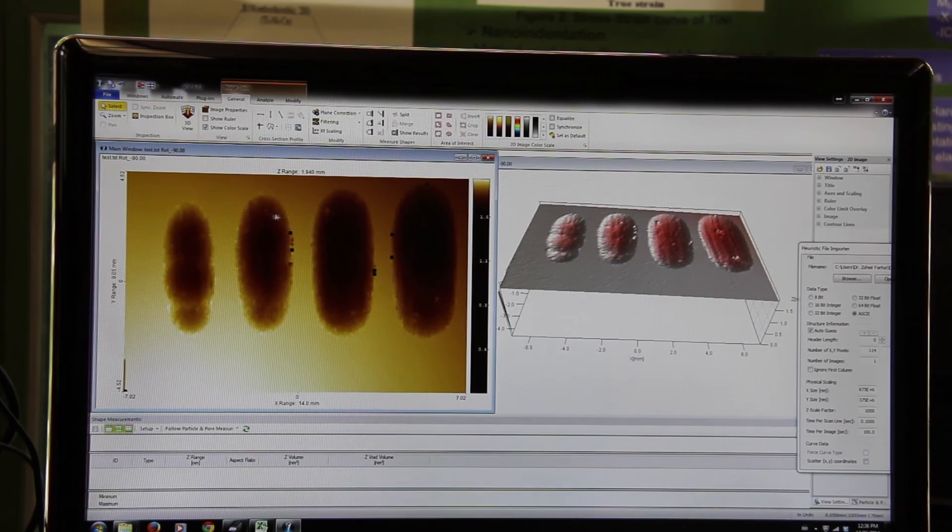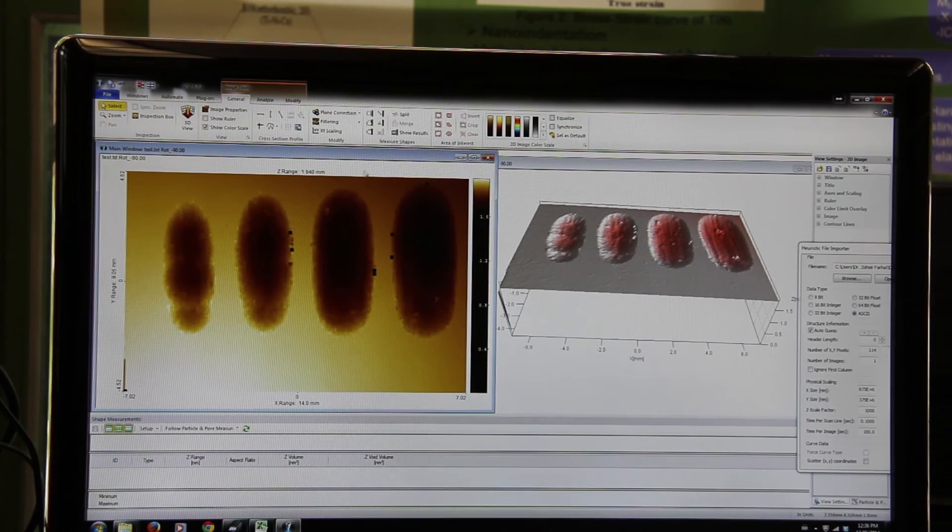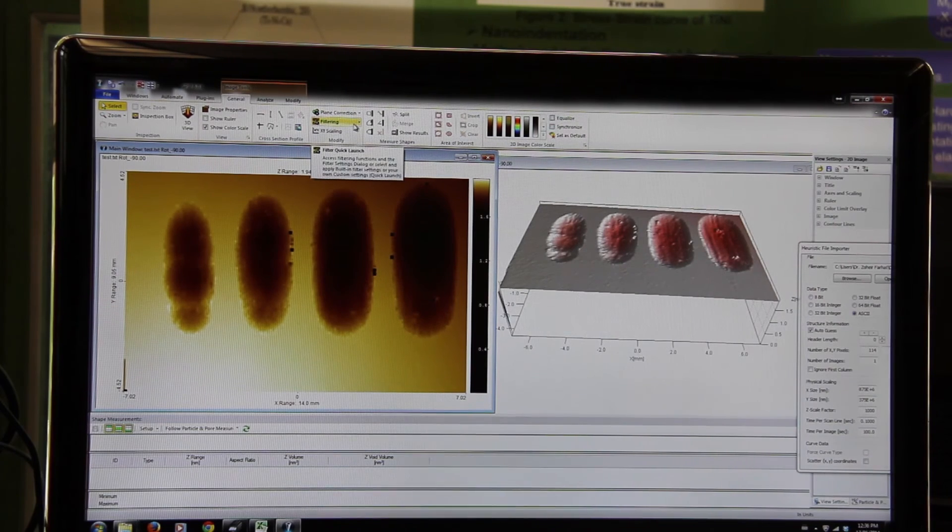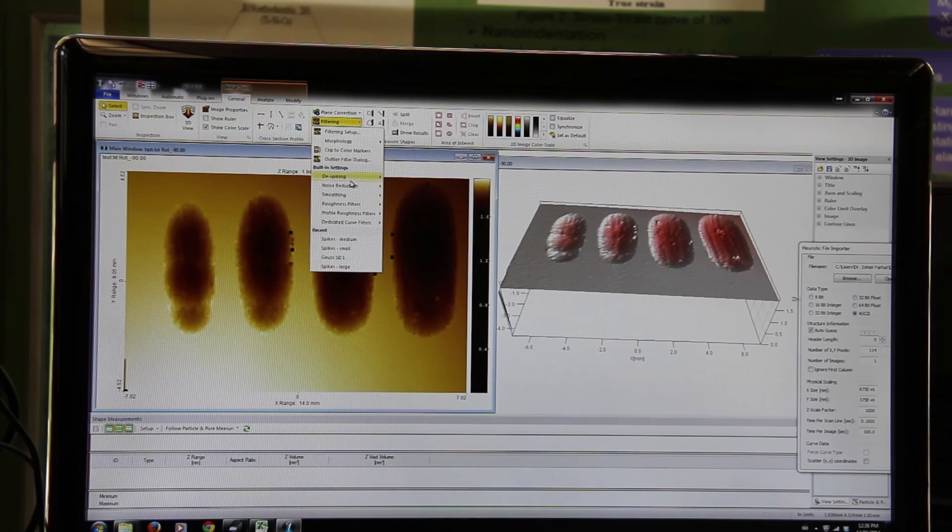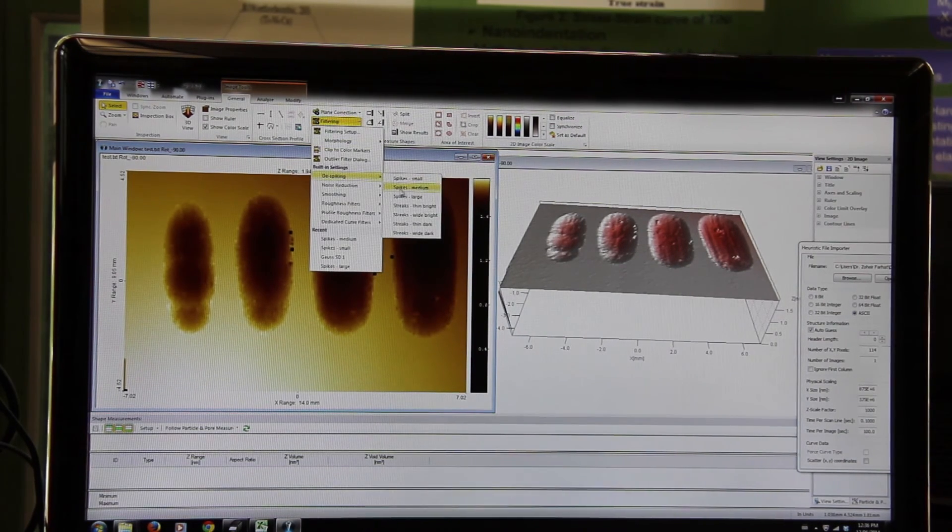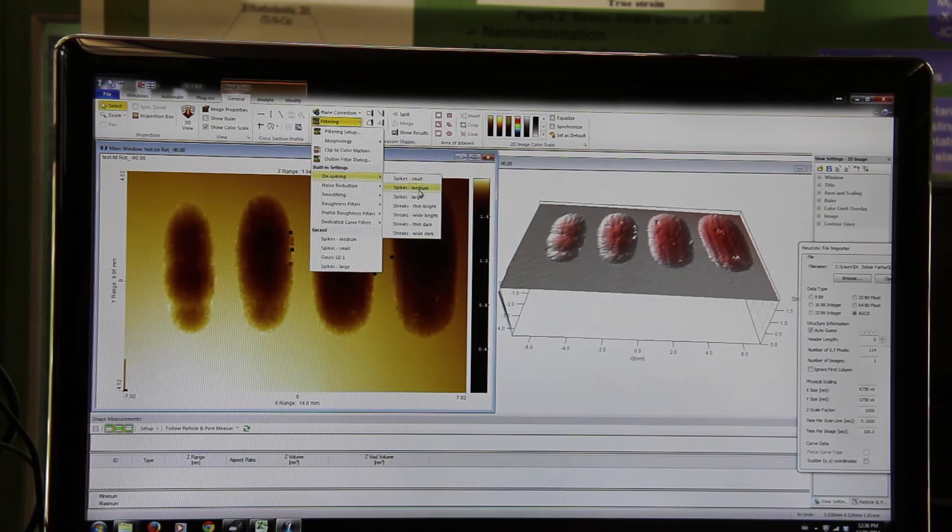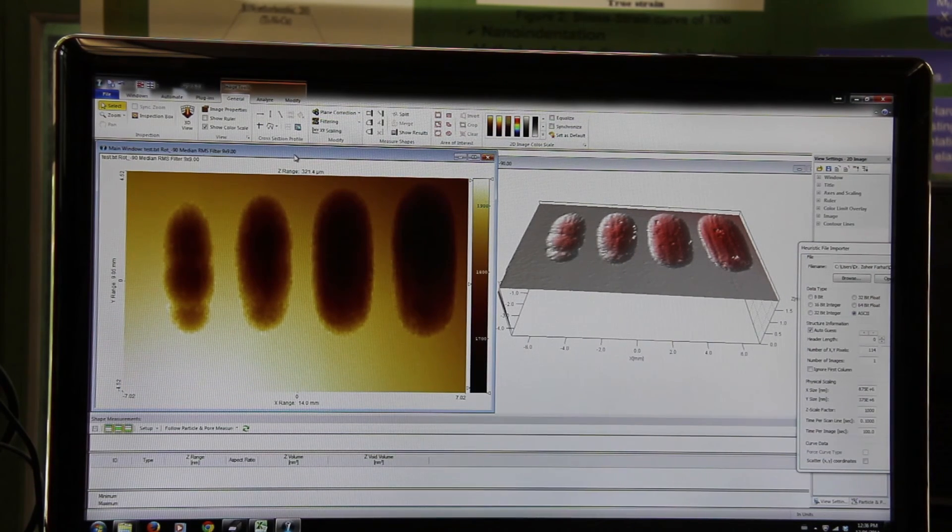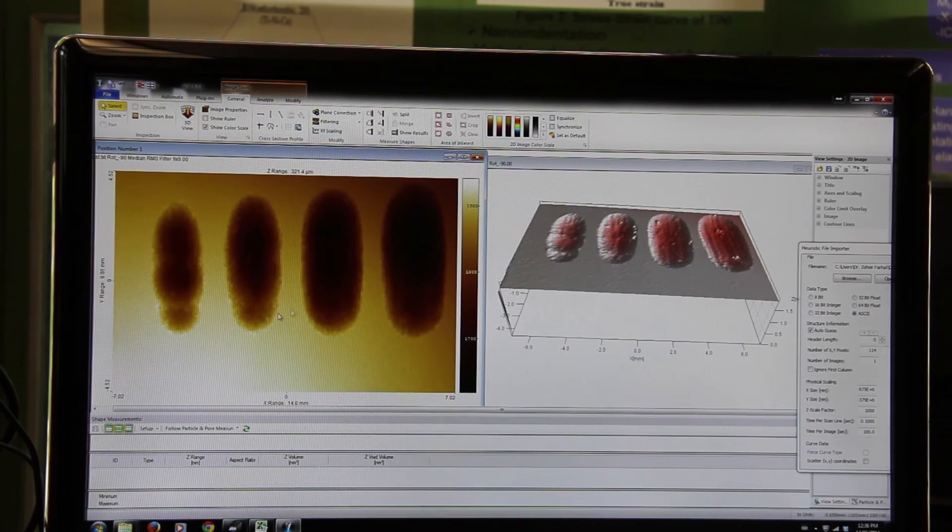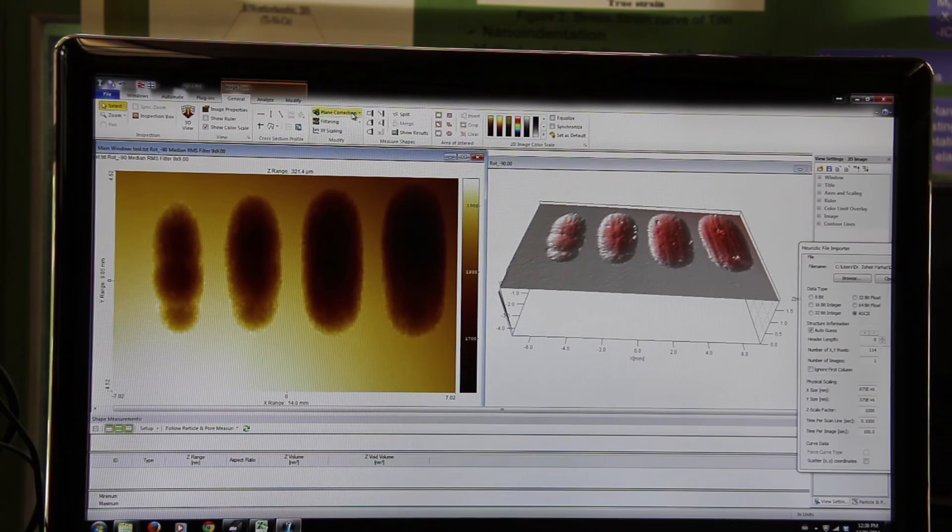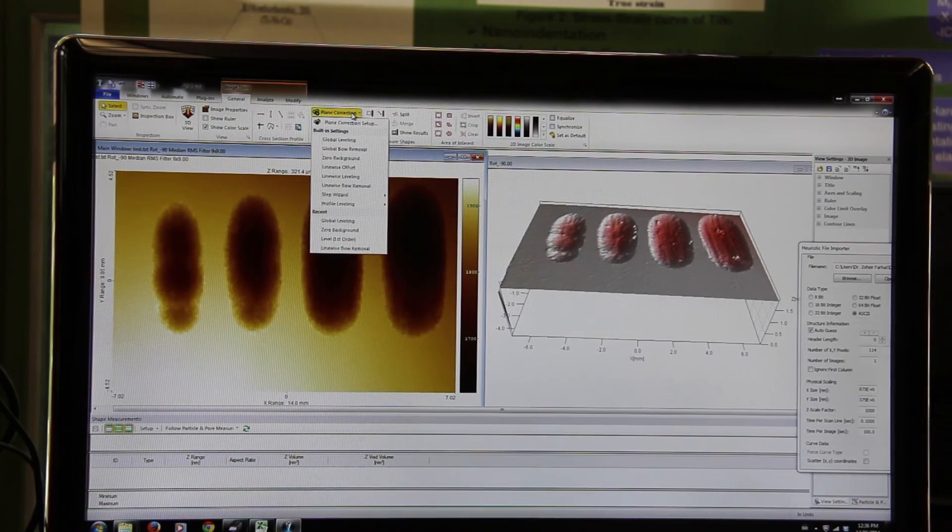You need to reduce those noise. In order to do so, just go filtering, de-spiking, spikes, medium. It will remove all those noise from the two-dimensional image.